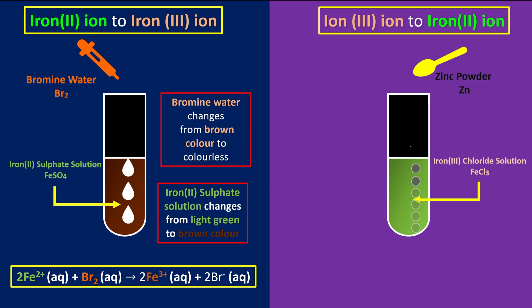So what you can see here is some of the zinc powder eventually dissolves in the solution. Because it itself is the reducing agent, it means it will undergo oxidation. So the zinc powder eventually oxidizes to become the zinc 2+ ion.